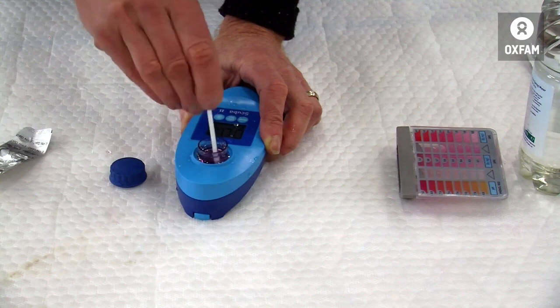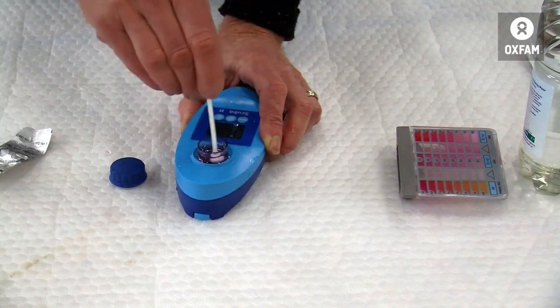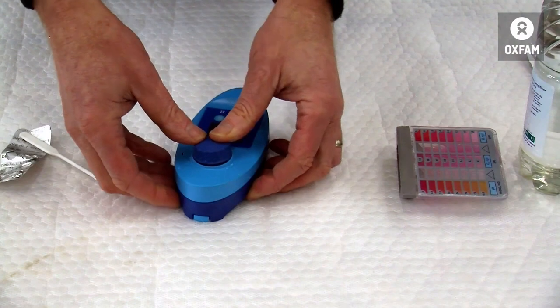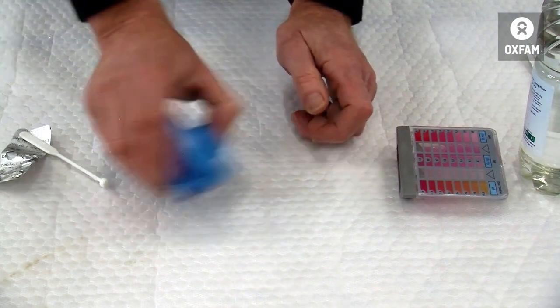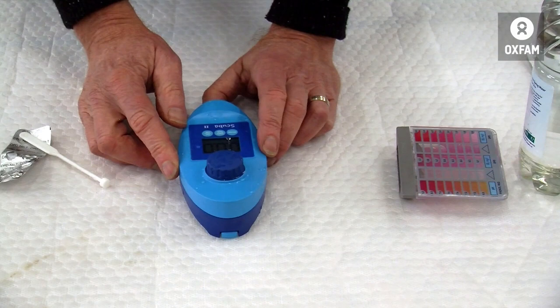So this requires a good crush. I can see the pieces at the bottom. Fix the lid, give it a quick shake. Let that settle for a moment.